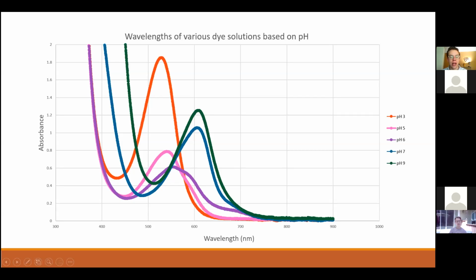If, for example, we had 2 different molecules that absorbed at different wavelengths, which then corresponded to 2 different reflecting wavelengths, and then we only observe one color, you can think of this as you have blue paint and yellow paint, and you mix it together to get green paint. Like there's 2 components, there's not 2 components. The single peak tells us that there's only one molecule providing the color, and then that molecule shifts along as we change pH to absorb at different wavelengths to produce color, which is kind of significant.